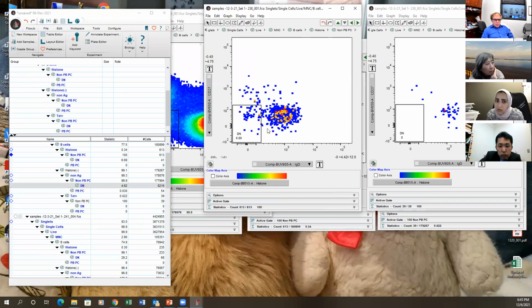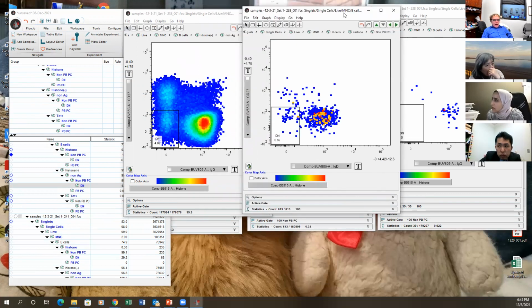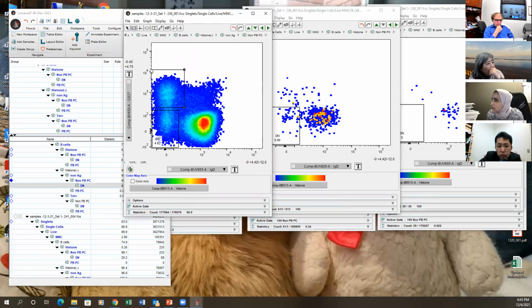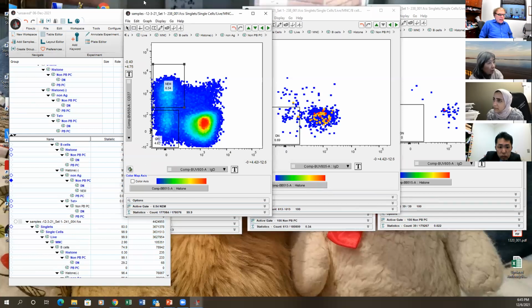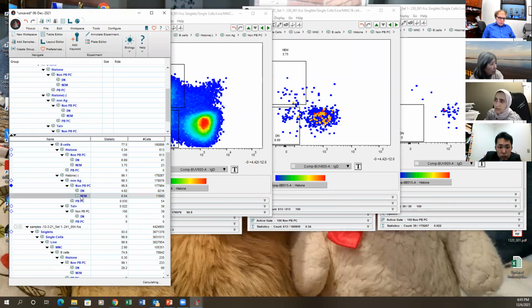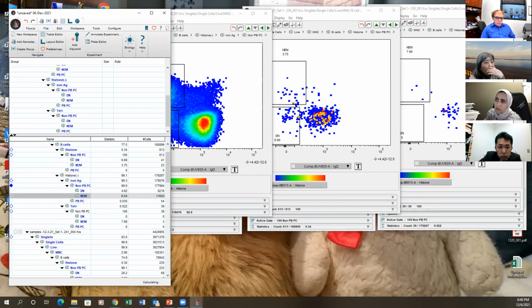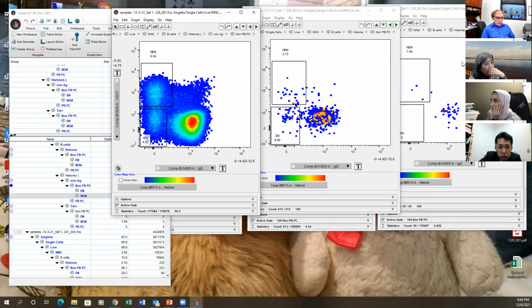Weiqing, this one does seem a little different with those wayward dots. I would say if you put a box on the percentage of the CD27 versus IgD, I think there's more memory in the RNP ones. Even though there's only four, I think the percentage would be higher. You can't really tell by looking. It's about the same. So move your square, include that other dot over there.